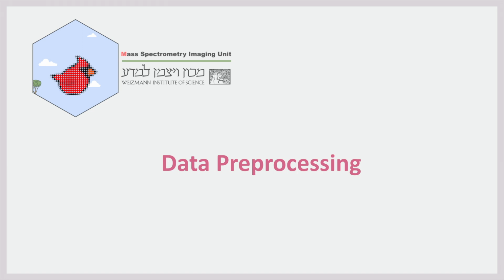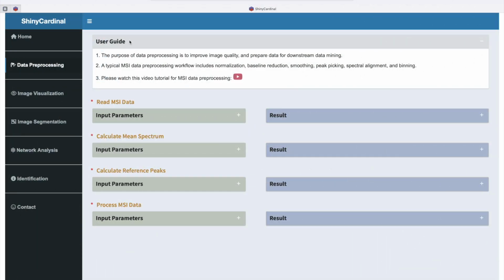This video tutorial is for mass spectrometry imaging data preprocessing. The user interface consists of three main sections: the user guide, parameter section, and results section. The user guide provides a concise overview of this module. You can configure the parameters in the input parameter section and obtain results from the results section.